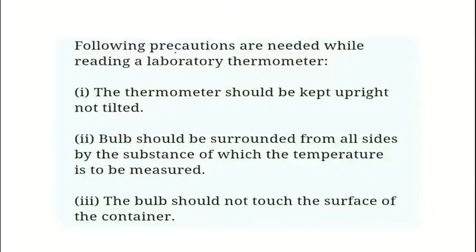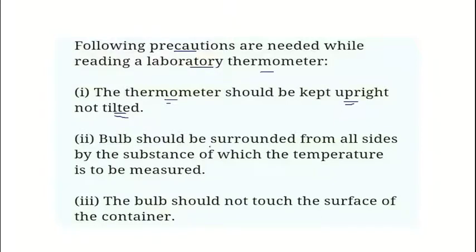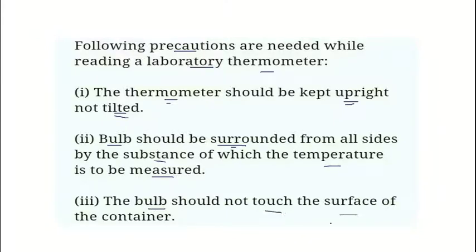Now let us learn the precautionary measures to follow while using the laboratory thermometer. You are supposed to place it upright — the thermometer should be kept vertical and not tilted, as tilting may lead to parallax error. The bulb should be surrounded by the substance all around while measuring the temperature. Since there is no kink, the mercury level will drop or rise depending on the surrounding temperature, so you will not measure correctly. Also, the bulb should not touch the surface of the container.